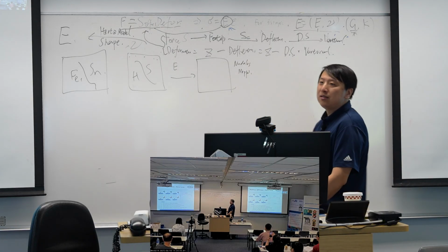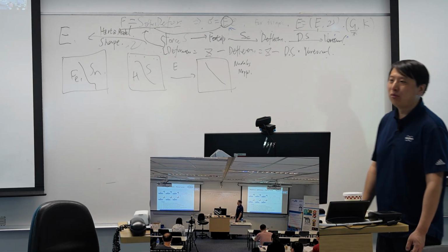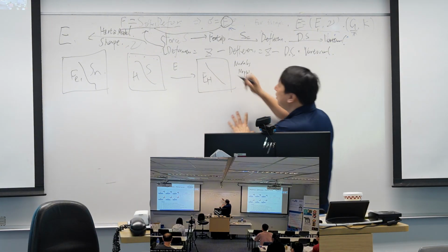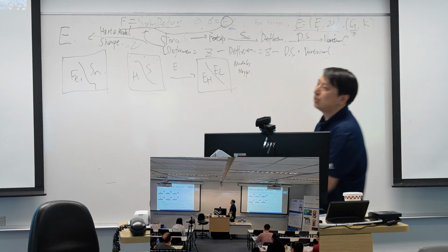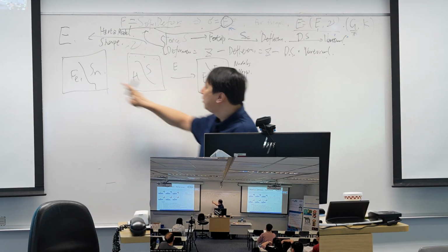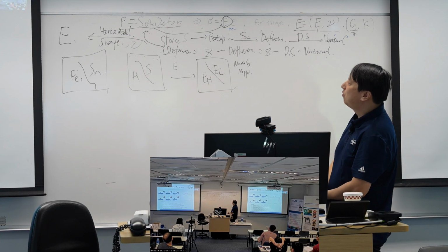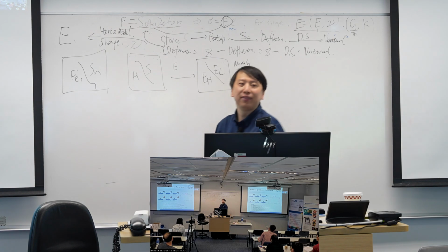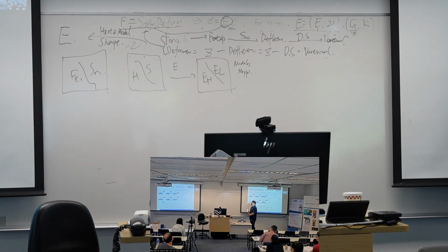On this mapping, it's not morphology anymore, but instead it shows the value of the modulus. So this part is high modulus. This part is low modulus. And then I know my sample: this low modulus should be tin, this high modulus should be iron. And then from this modulus mapping, I get the component mapping. That's the purpose of the modulus mapping.